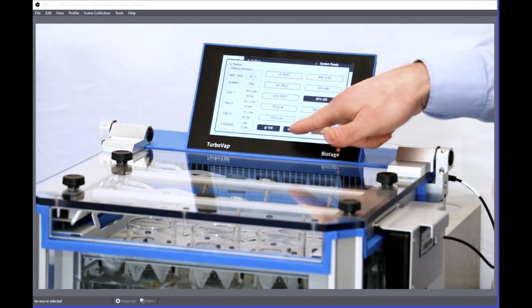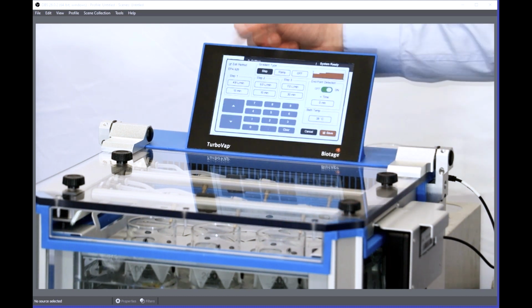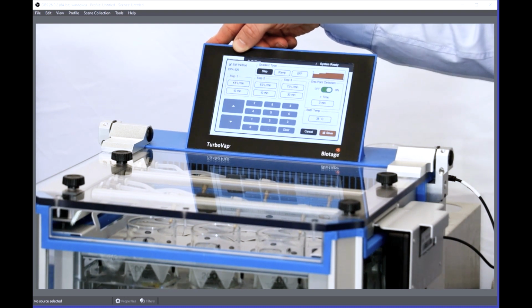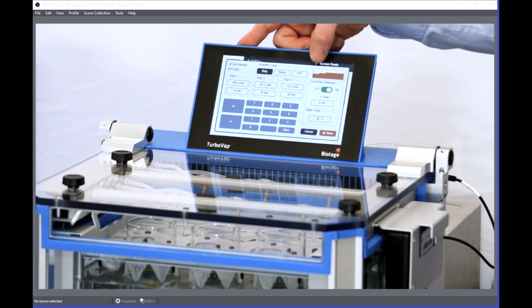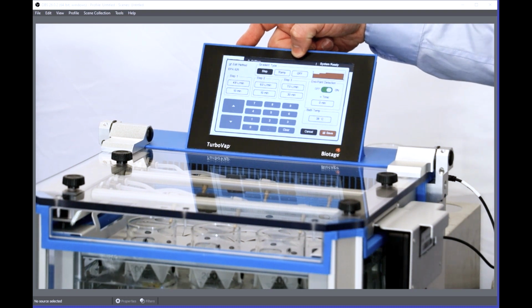Now, if you dive deep into the method when you create it, this method right here is labeled EPA 625. It's a method that uses typically larger solvent volumes of methylene chloride. And as you can see, there's different steps. It has 3 different steps, and these steps indicate the flow rate of your nitrogen that's blowing into your tube.